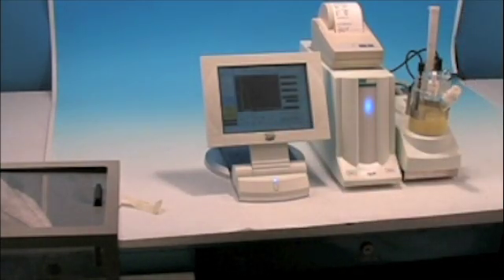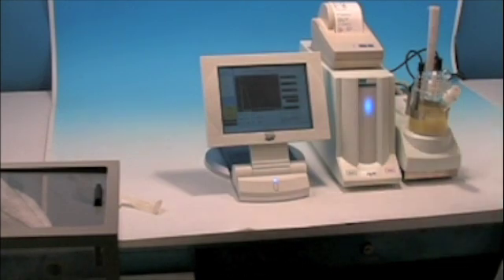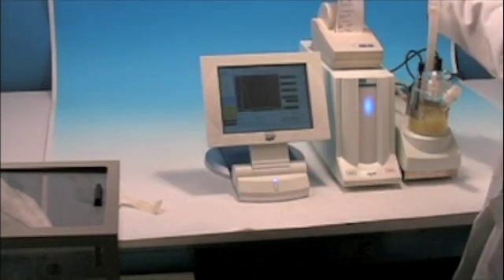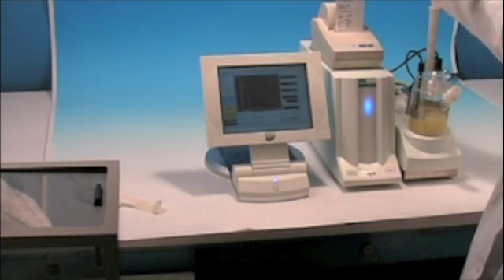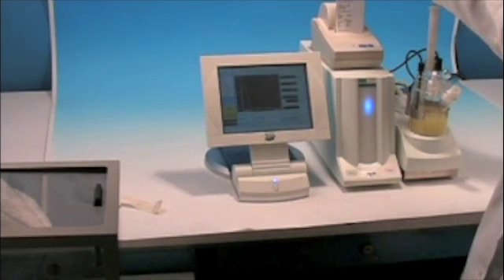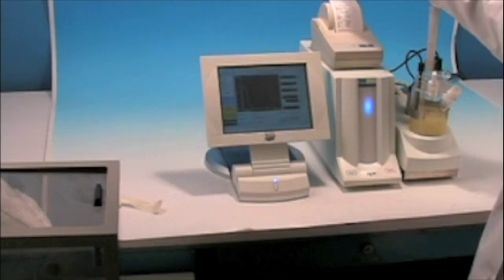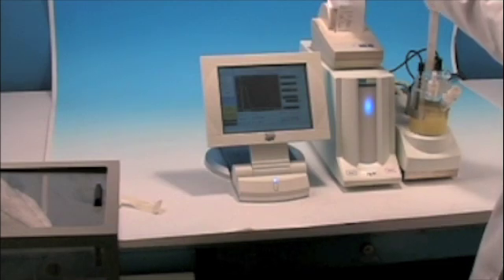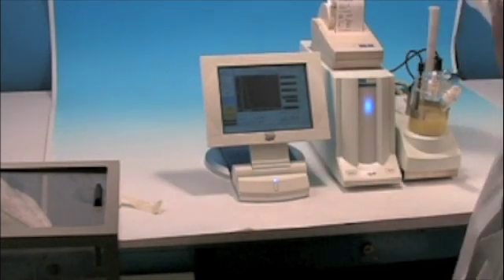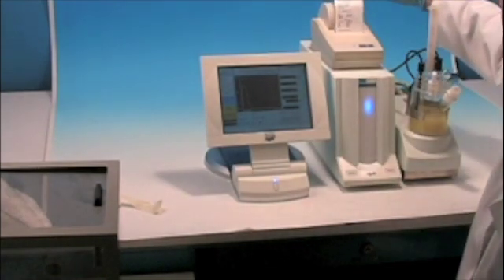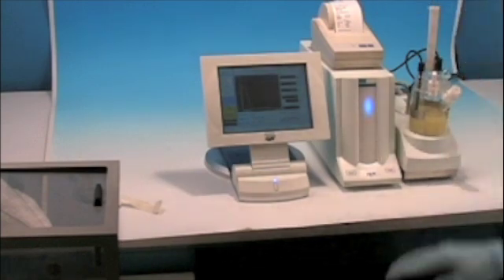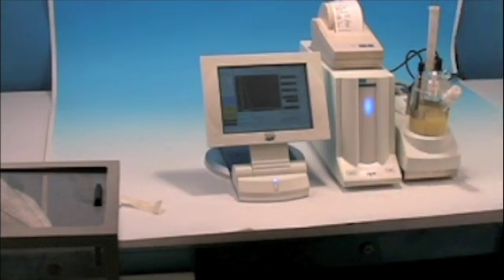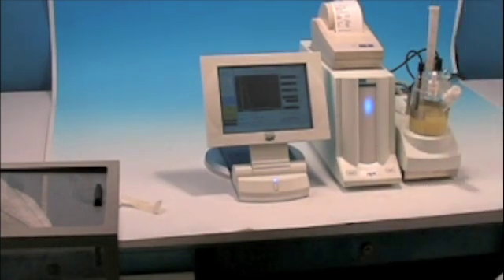And our third test 822 parts per million. So the first test was 797, our second was 850, and our third is 822. And that's just me running through these pretty quickly, all pretty good range there. And we're in a fourth one and so we have four results for these tests.